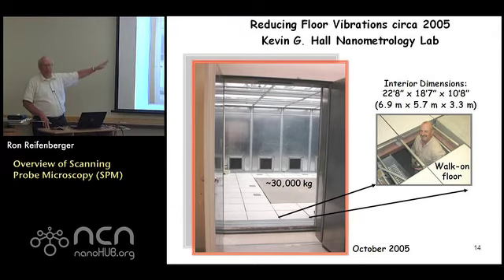So what we do now, knowing the importance of these scanning probe microscopes, right? The current trend is to design buildings and rooms inside of buildings which are vibrationally isolated. And then you put your microscope on this slab. You put all the electronics on the floor surrounding it. The slab is separated from the floor. And it's beautiful, right? So when I moved from physics to Burke, I went from a situation where in physics I could, not me, my students could only take data like after 6 p.m., right?